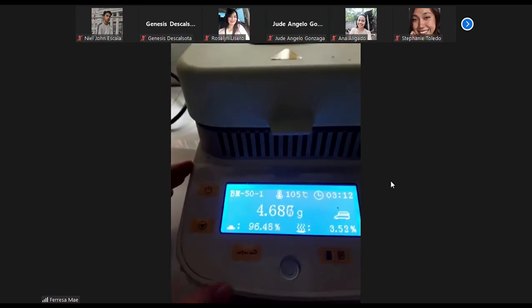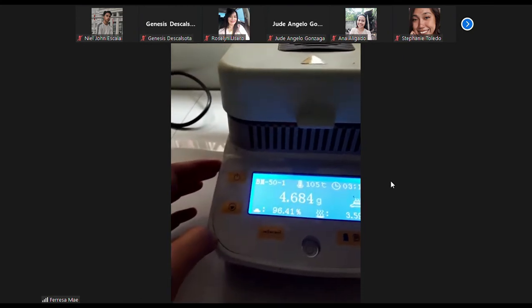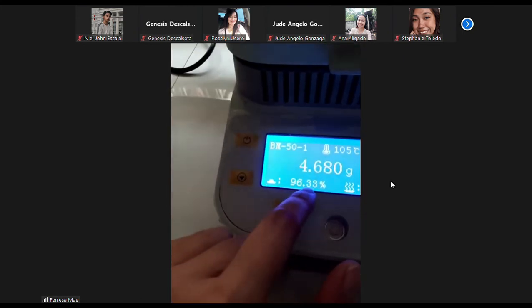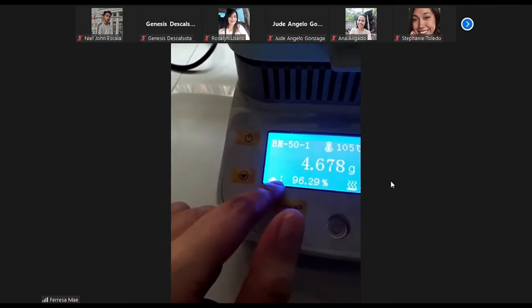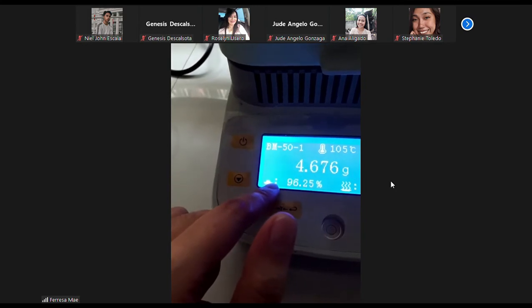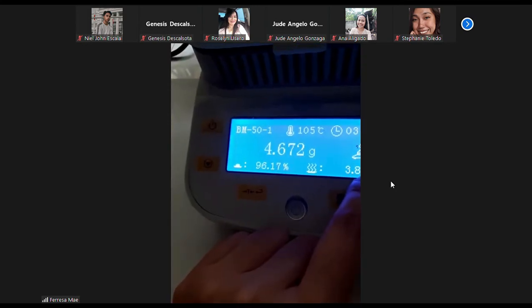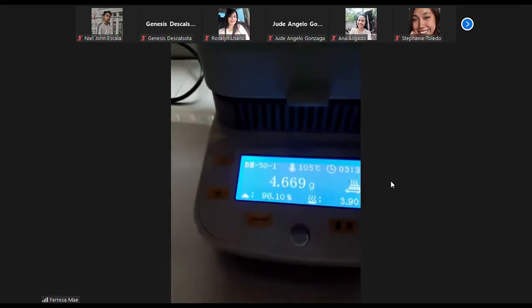Miss, ano gani, Miss, tawag sang isa ka number nga may percent ang tupad sang moisture, Miss? Amo ni siya ang 96 percent sang sample nga wala water. Sa arim amo ni siya ang water content mo, moisture content. Okay, Miss. Thank you. Welcome.